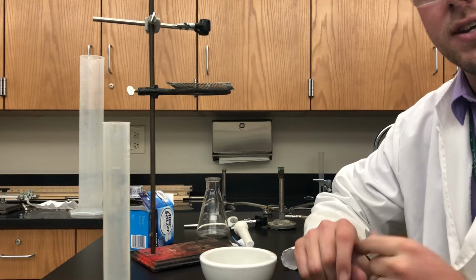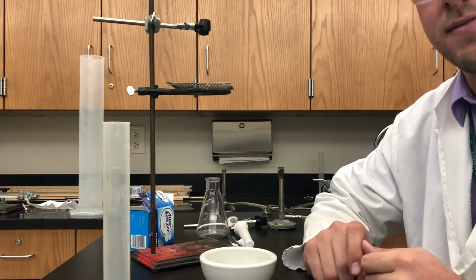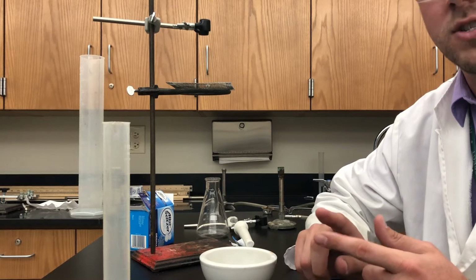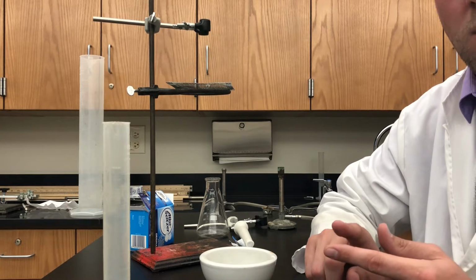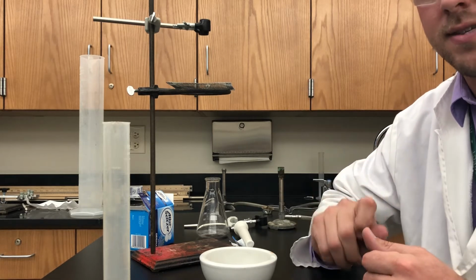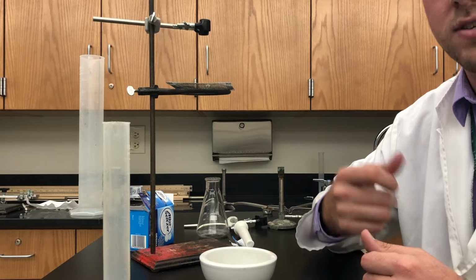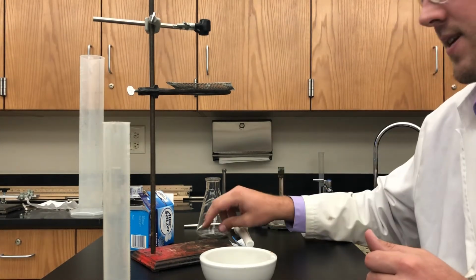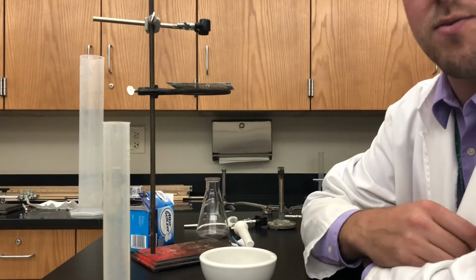Now I'm not actually going to talk about 3 and 4 in today's video because number one, I want you to discover what the relationship between temperature or particle size and reaction rate is. So how does the temperature of a reaction affect how fast it goes, or how does the particle size of a tablet affect how fast it reacts?